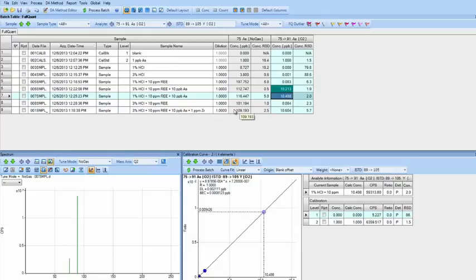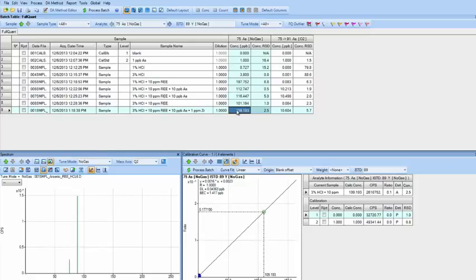And lastly, we've taken the 3% HCl with the 10 ppm neodymium and samarium, along with our 10 ppb arsenic spike, and also spiked with 1 ppm zirconium. As you can imagine, the 75 mass no gas of arsenic doesn't show the addition of zirconium because zirconium's primary isotope is 90 and 91. However, in our oxygen mass shift mode from arsenic to 91, we get great correlation, just as we had before there was any zirconium in the sample, of 10 ppb arsenic.